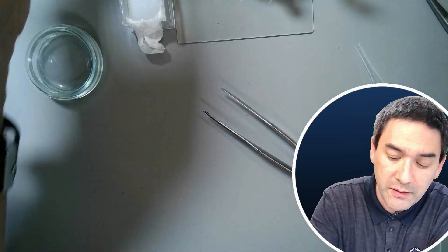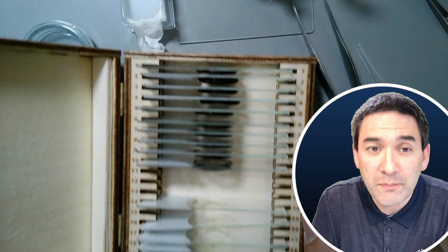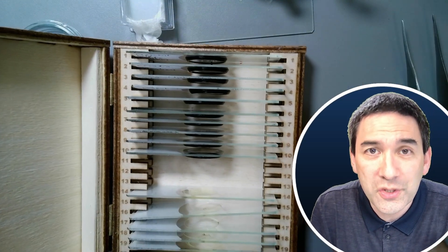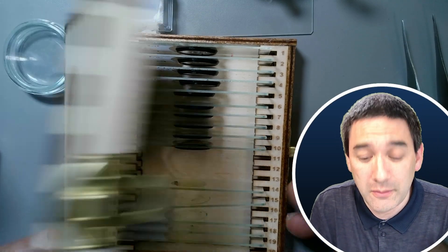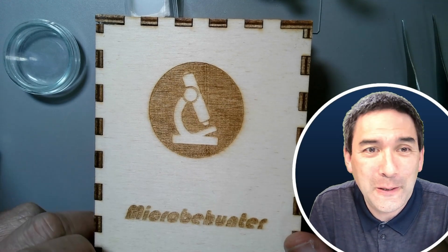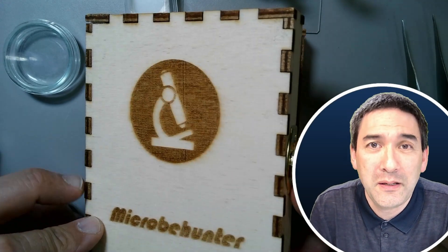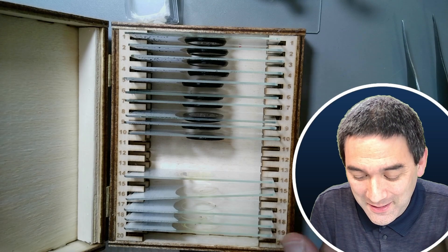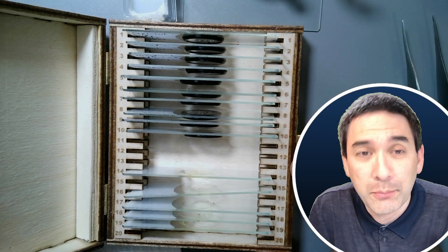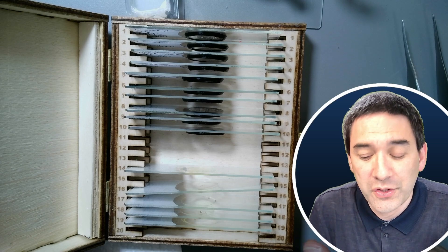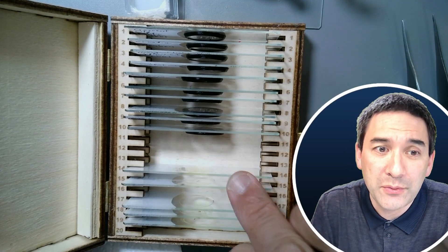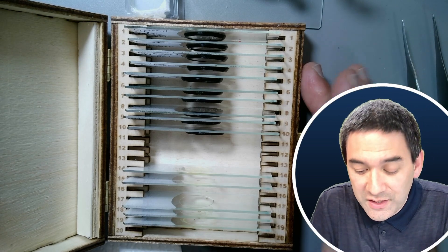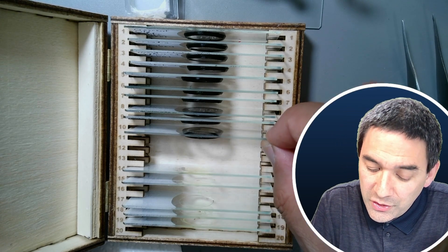That's almost everything. I wanted to show you another practical tool, a slide box. There are all sorts of slide boxes available online, plastic and wood, expensive and cheap. This one I made myself. That's why I added a logo over here. Out of personal interest, I used my laser cutter to make these slide boxes. I recommend you get yourself a few of those provided you're interested in making permanently mounted slides. Not everyone's interested in making those, and in that case you do not need them.